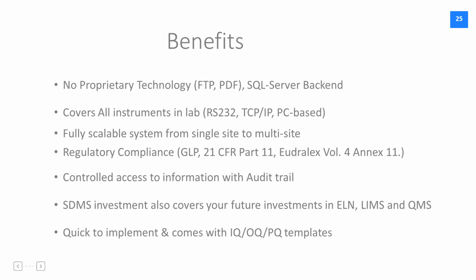The system has a controlled access to information with audit trail facility. Your SDMS investment will cover your future investments in ELN, LIMS and QMS as well. The data inside SDMS can be provided to these external systems so your investment doesn't stop at SDMS.